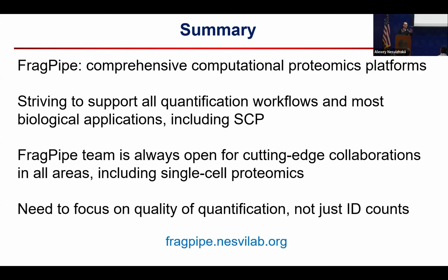It works beautifully for high abundant peptides. You can demultiplex, correct for all of that. And then you start getting outliers and you look at them and it's a low abundant signal, you overcorrected, it created differential expression. So it may work really well for maybe even 90% of the signal. The question is, will you start creating artifacts in the data for something at the noise level that perhaps what you're most interested in, accurate quantification of low abundant things.